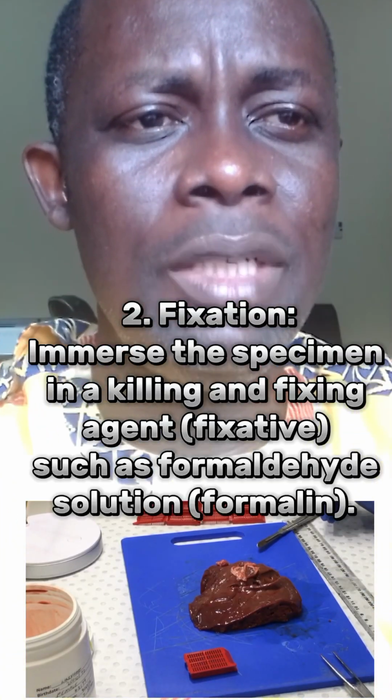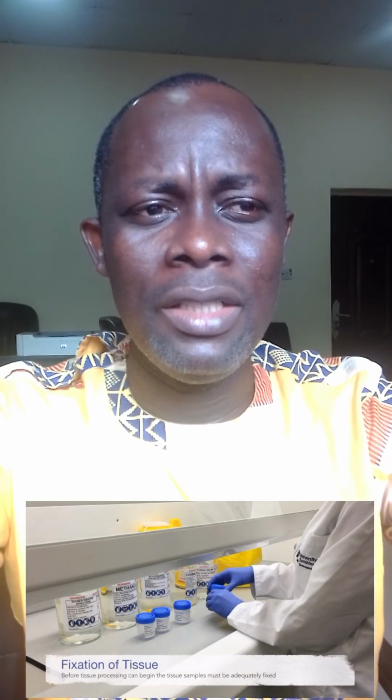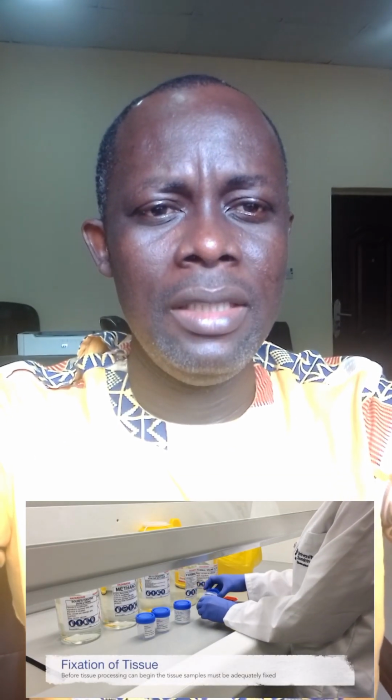The second step is fixation. In this step, you immerse the specimen in a killing or fixing agent such as formaldehyde solution or formalin, and this solution easily penetrates the sample, causing it to change physically and chemically, and then harden and preserve it for subsequent processing. Now the third step is dehydration.